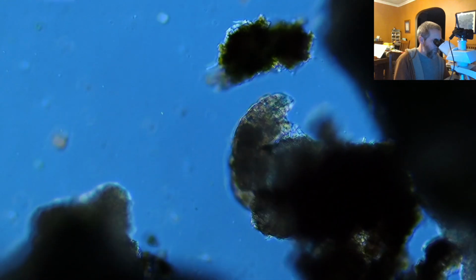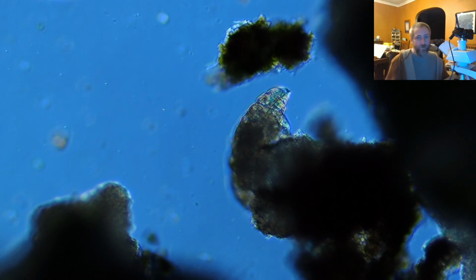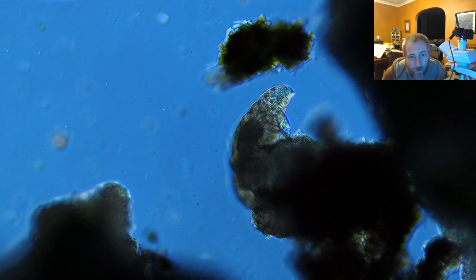Nematode, there's another water bear right there. It's not moving very much. Maybe we can get in a little bit closer on that one. He seems like he's a little bit slow. Probably still waking up.